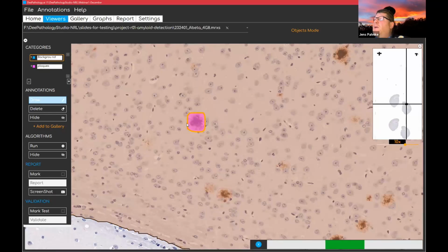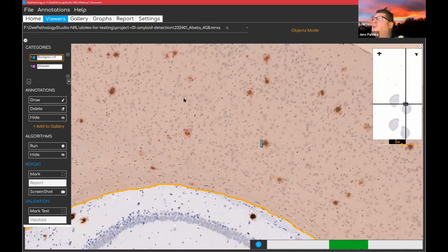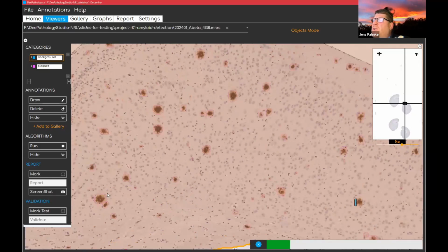So I can take this away, and then I declare this as background, just to prevent that it is taken into more consideration later. But it looks already very fine. To me, it is becoming much, much better. And you see here, all the small things are detected. It goes quite nicely. You can use fluorescent images. That's even easier. That's absolutely no problem.